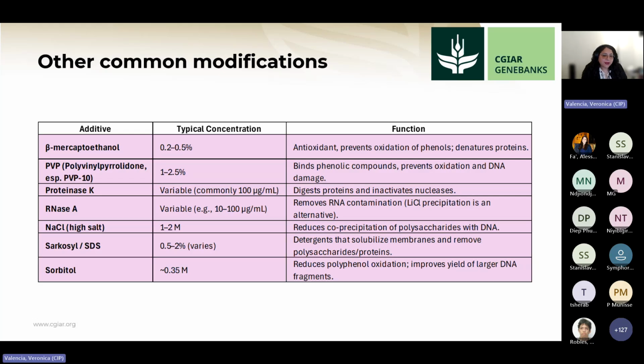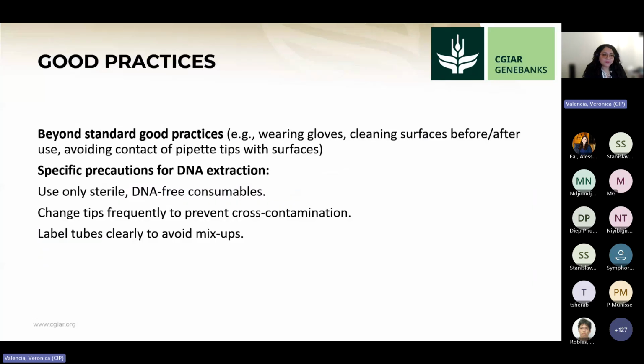But you have to be very careful with mercaptoethanol. It's a common practice to collect in the setup with mercaptoethanol, but we have to be very careful not to inhale it, because it smells horrible, and it's quite dangerous. We have to be very, very careful.